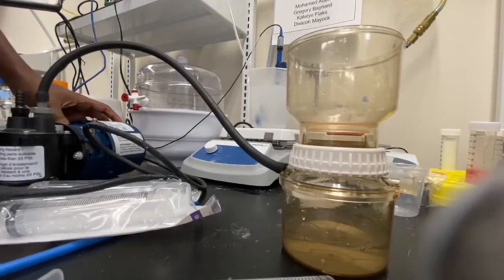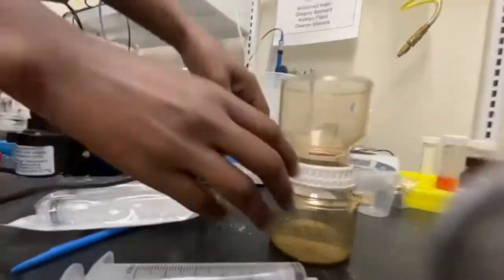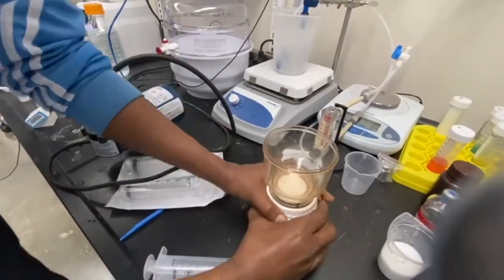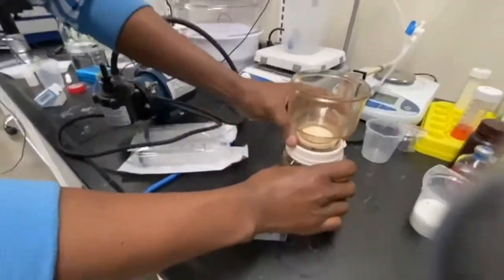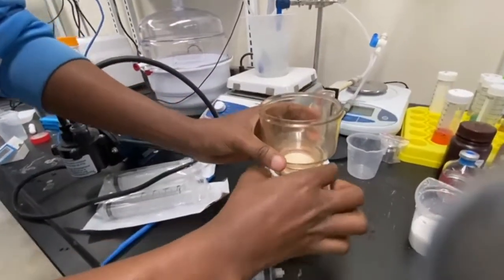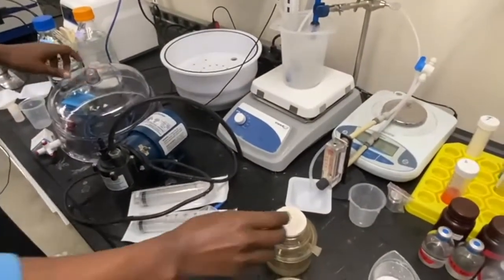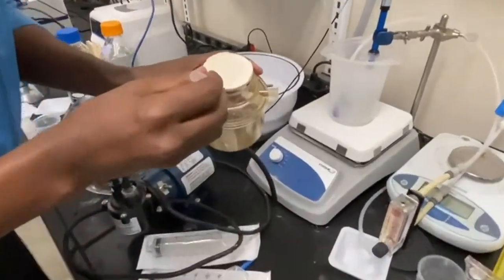In increments of 2 hours, we'd come into the lab and take a sample of solution from the reactor and filter it to remove any calcium carbonate that precipitated. After drying the filter paper overnight with a desiccator, we'd then measure the mass of the calcium carbonate on the filter paper and scale it up to find our estimated mass of calcium carbonate in the reactor. This helps us determine the mass of carbon dioxide our reactor removed over that period of time.